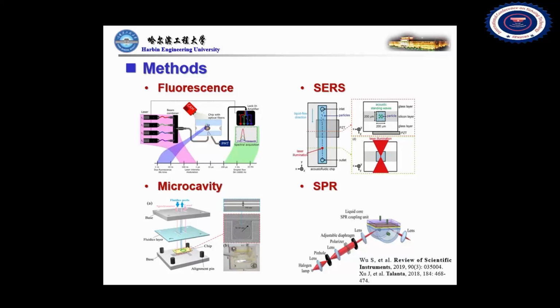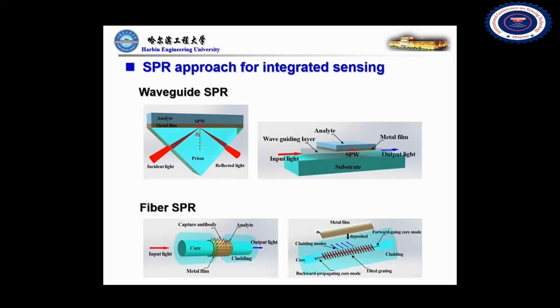The resonance peak caused by electron oscillations on metal surfaces can be used to analyze the extremely small refractive index changes. Among these detection technologies, SPR is a non-label detection technology which can avoid the use of fluorescence, radioactive labeling, and enzyme, and has the advantages of low cost, high sensitivity, integration, and reusability, and has bright prospects.